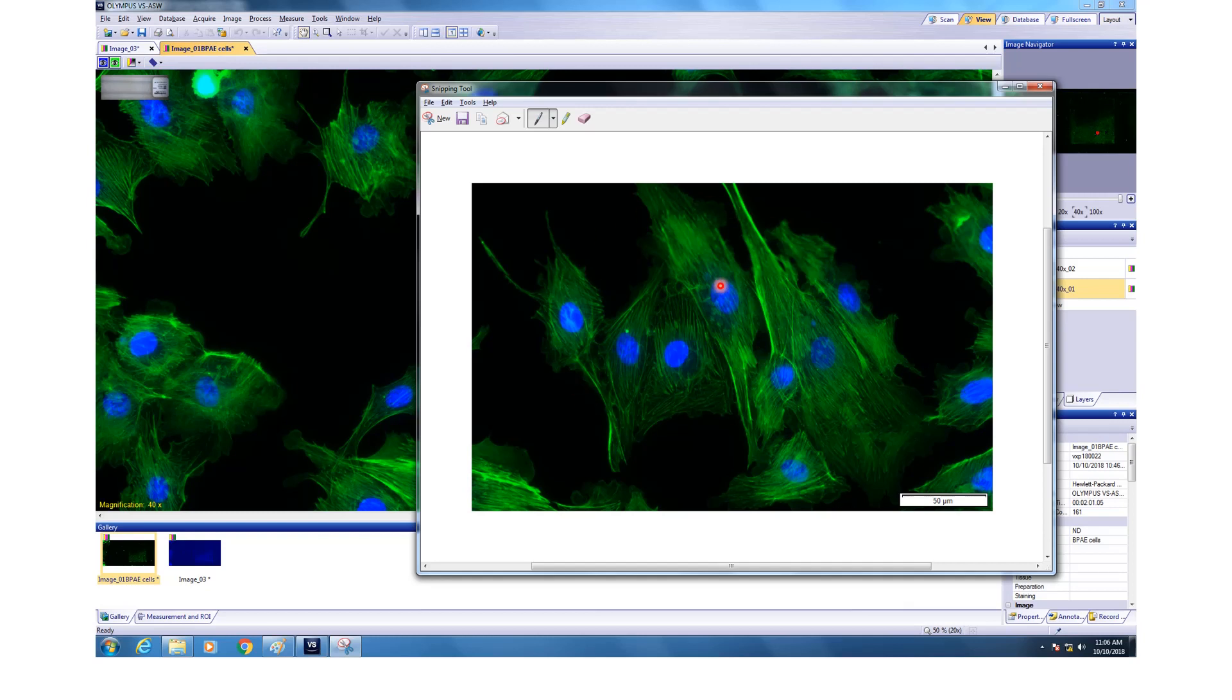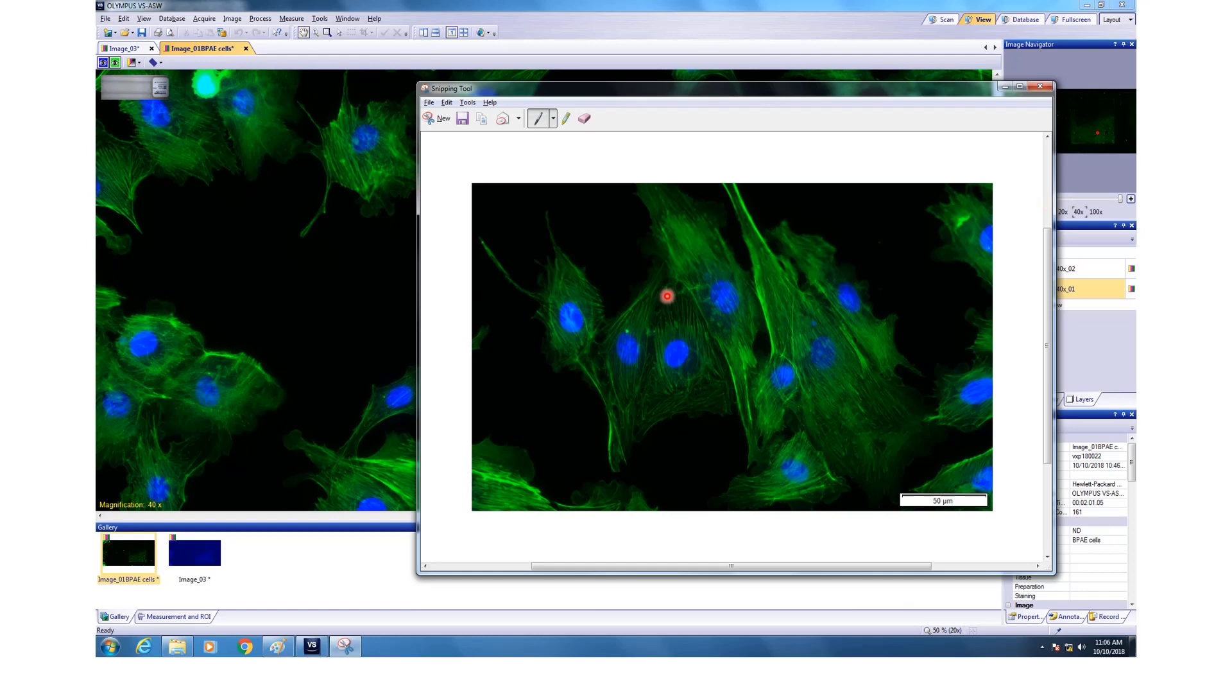If you don't want the DAPI, you can switch off using this button. If you don't want FITC, you can switch off using this. If you want to adjust the brightness, you can select one at a time and then adjust the brightness in the software itself.